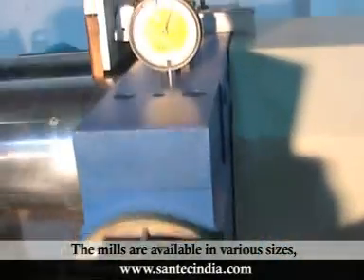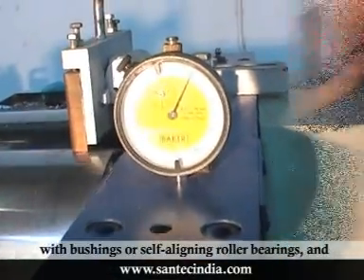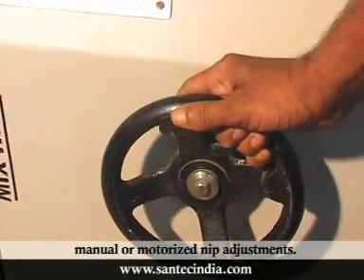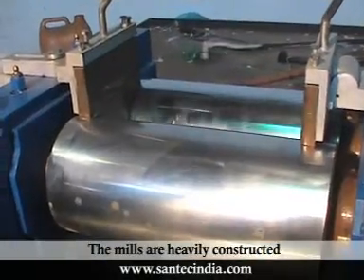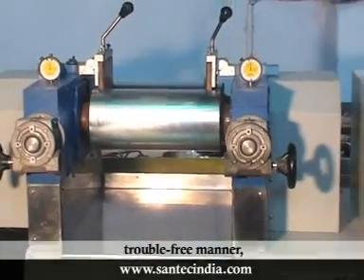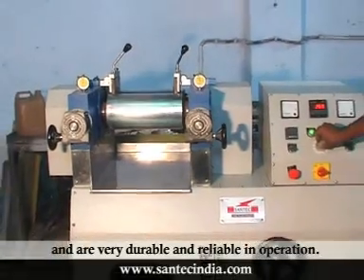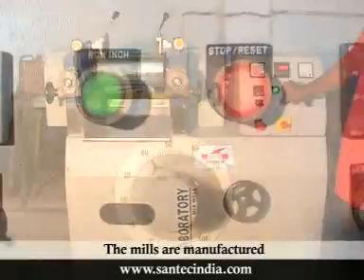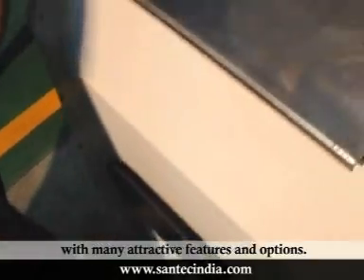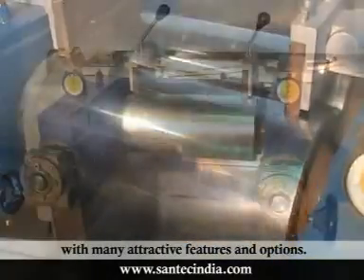The mills are available in various sizes with bushings or self-aligning roller bearings and manual or motorized nip adjustments. The mills are heavily constructed to mix newer and tougher compounds in a silent, trouble-free manner and are very durable and reliable in operation. The mills are manufactured as per rigid international standards with many attractive features and options.